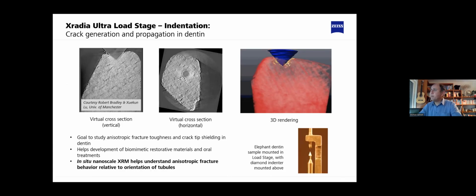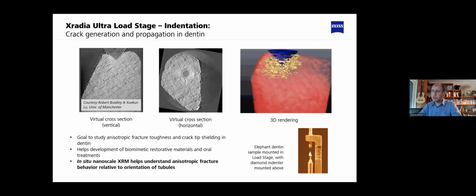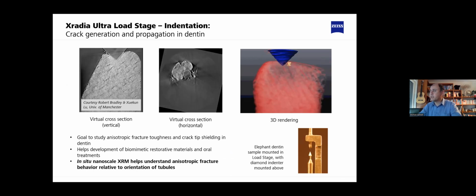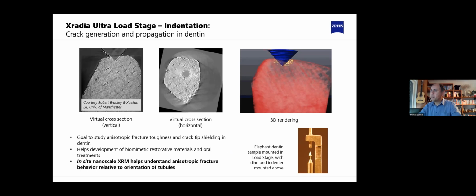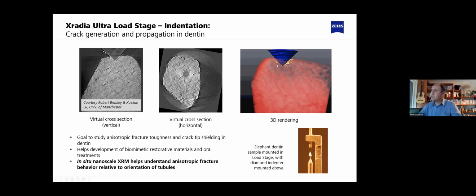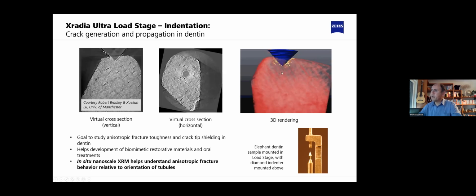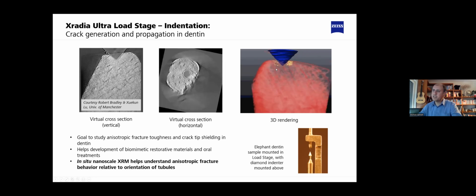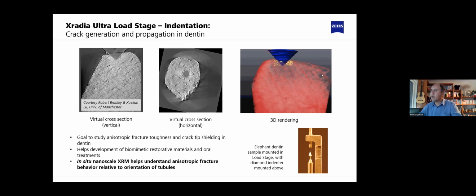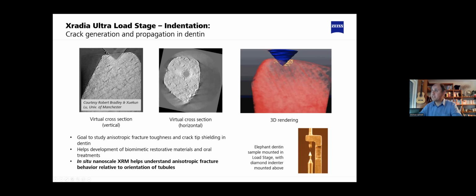That's also another example of using, in principle, indentation and then 3D characterization to see how the cracks are propagating in dentine. In principle, the yellow segmented features here are cracks that are suddenly growing and actually exploding, and then you can see in which step it is going to happen, and you're having a full 3D characterization of your material with a resolution down to 50 nanometers.